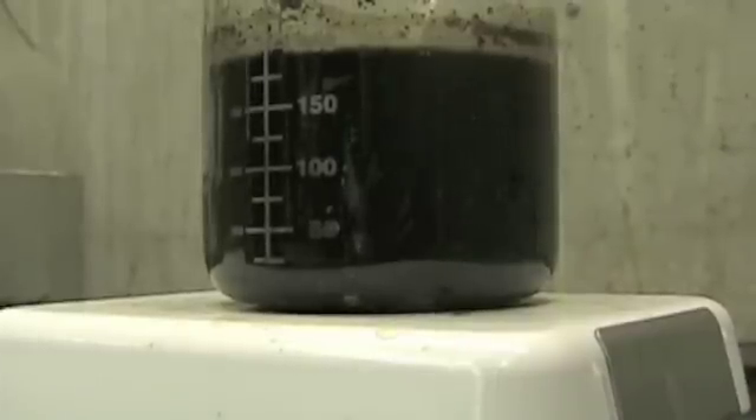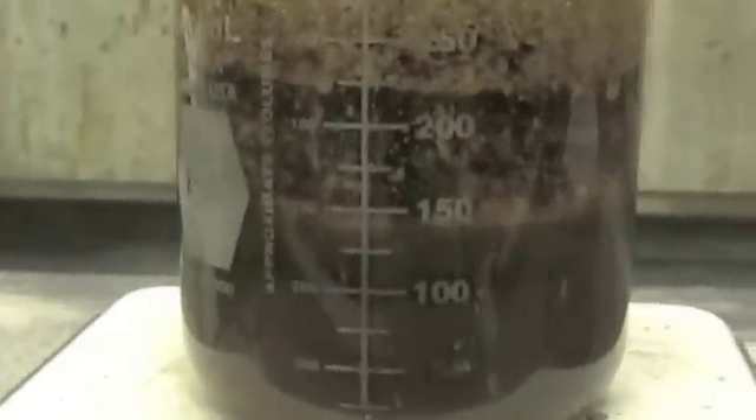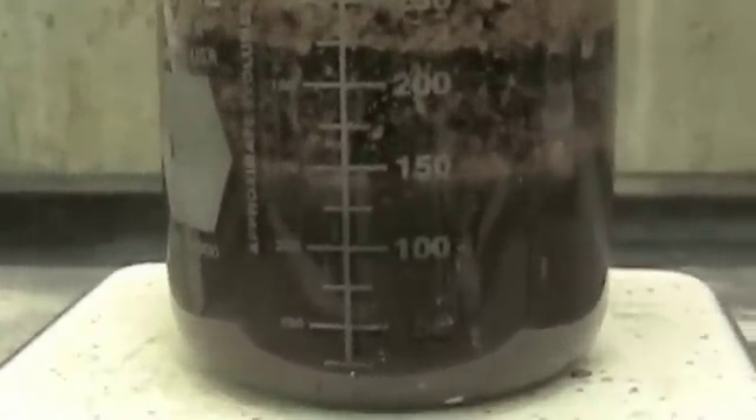And then we wait approximately an hour until the ammonia has evaporated. Notice that almost all of the ammonia has gone, and we are ready to remove the beaker from the hot plate and allow it to cool.